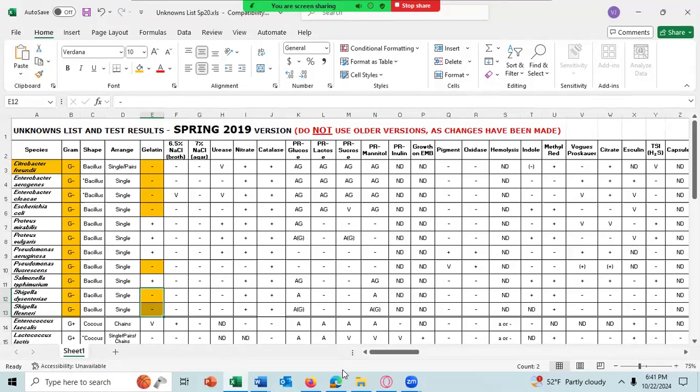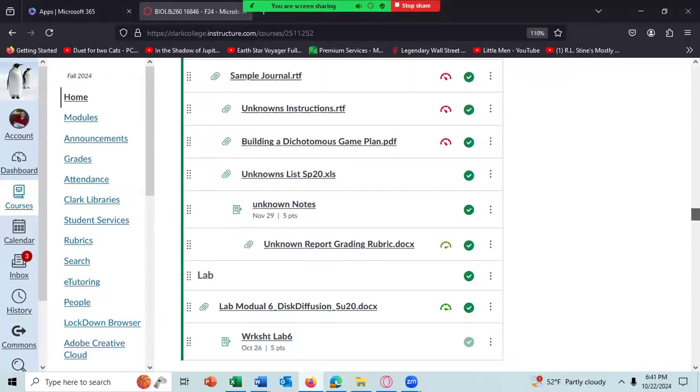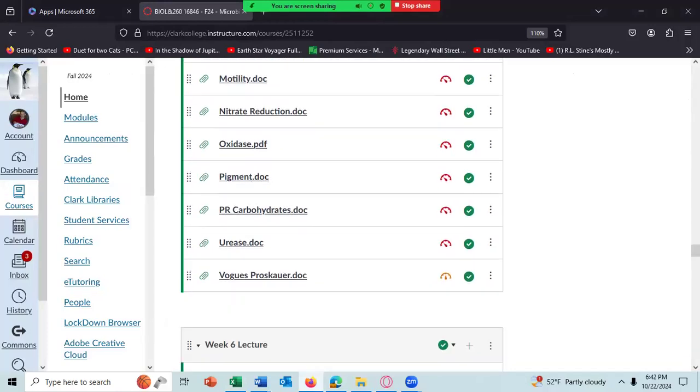I don't have it under here as lactose or PR glucose or PR mannitol or whatever the PR test is.